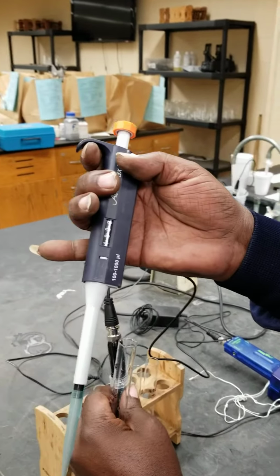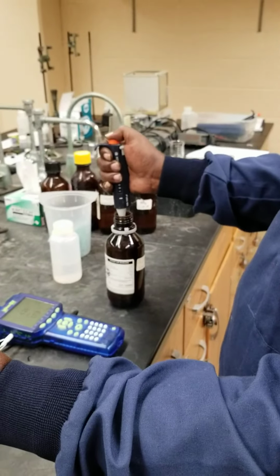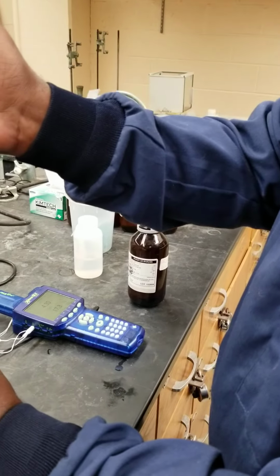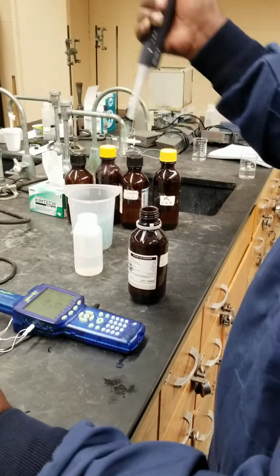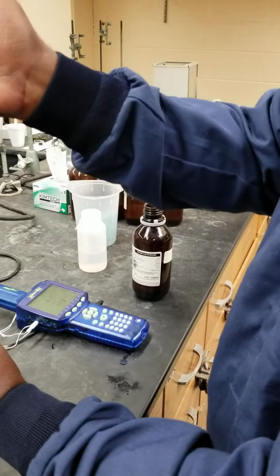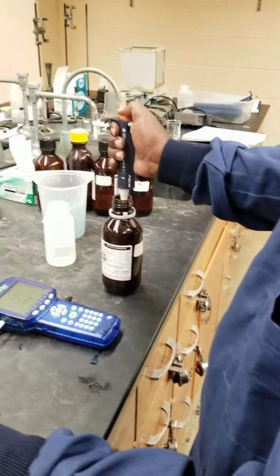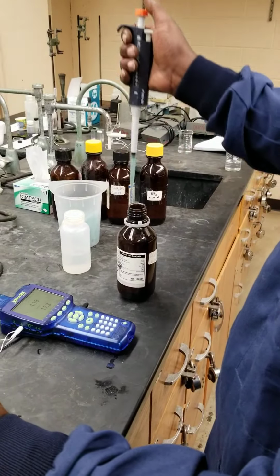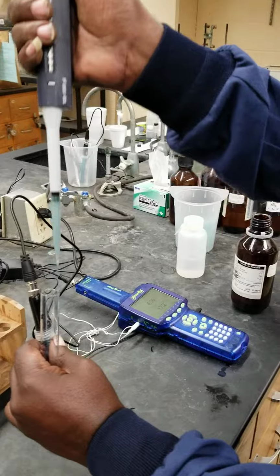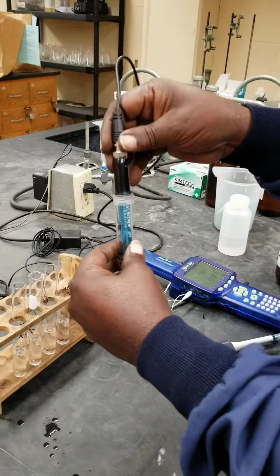So again, 1.00 milliliters. One. Two. Add the level. Show the level. Three. At this point I want to mix a little. Maybe I can use the electrode to mix.